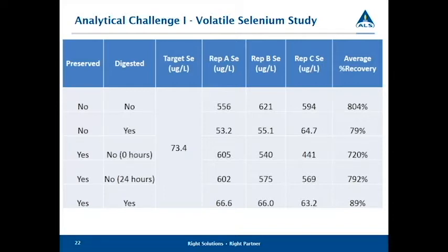So obviously, speciation first of all allowed us to determine what this peak was, but it also gives you a better way of looking at your actual whole sample and seeing what particular species could have an impact in the environment.